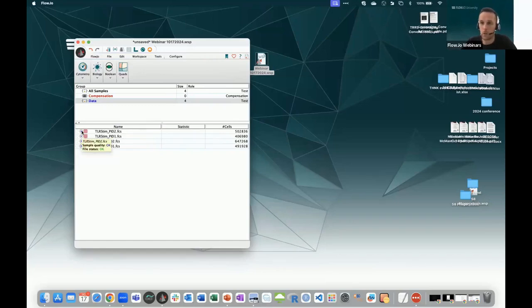If it's green, that means you have almost no flaws, or really little flaws. If it's blue, it's okay. And if it's any other color, so orange, pink, or red, that means you had issues running those samples on the instrument. Here in this case it's blue, so that means little to no flaws on our samples.